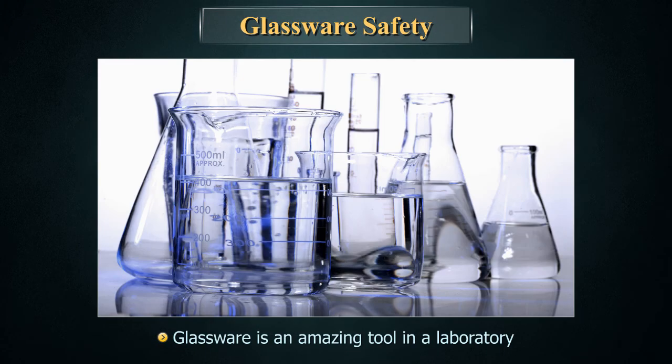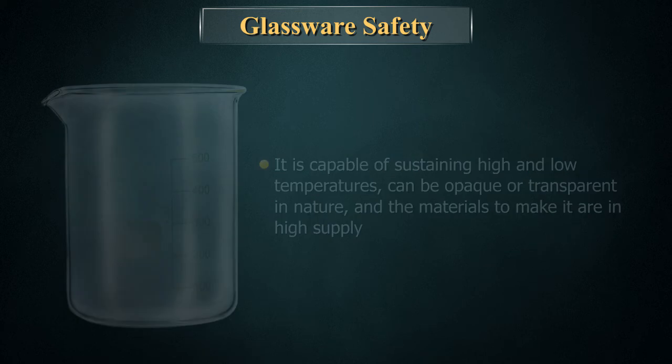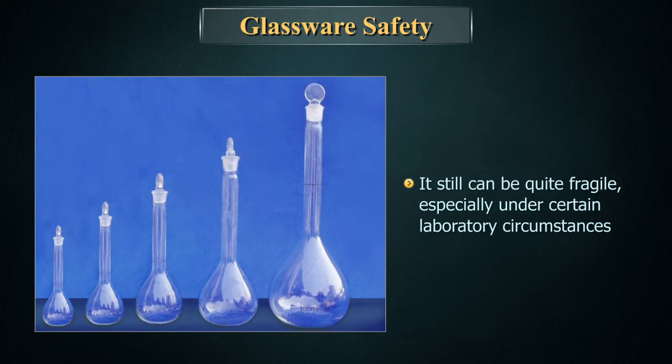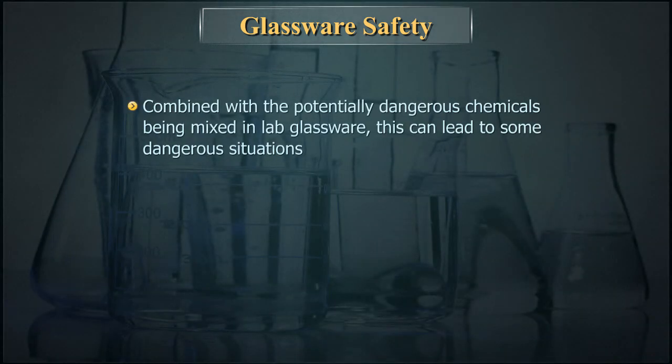Glassware is an amazing tool in a laboratory. It is capable of sustaining high and low temperatures, can be opaque or transparent in nature, and the materials to make it are in high supply. However, it still can be quite fragile, especially under certain laboratory circumstances. Combined with the potentially dangerous chemicals being mixed in lab glassware, this can lead to some dangerous situations.